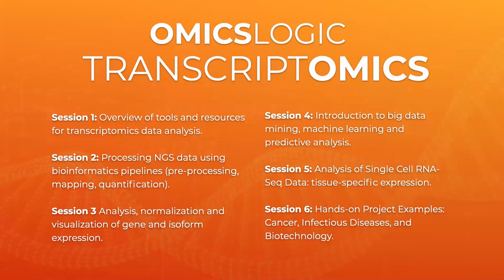Then we'll discuss analysis, normalization, and visualization of gene and isoform expression. We'll do this using both cloud-based tools that are intuitive and easy to use to understand the logic of analysis, and also discuss some of the typical packages in both R and Python for analysis and visualization of such data.